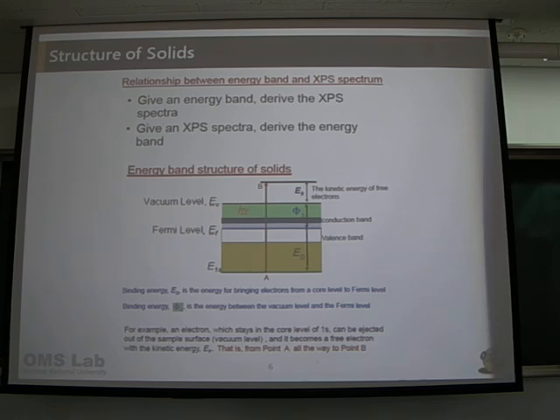Actually, if we consider the Fermi level, up to the Fermi level the electron can come back to its actual position, but when it goes out to the vacuum level, it is fully ejected and there is no withdrawal. It just goes out as in a photoelectron spectrum. When the electron goes out, it cannot come down. It's fully out. That is the vacuum level.